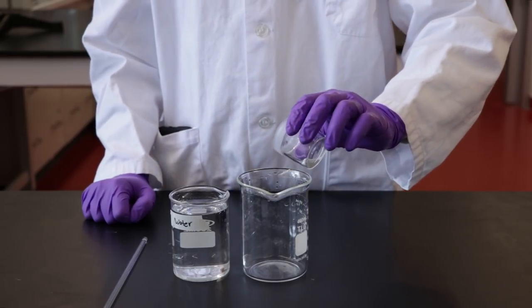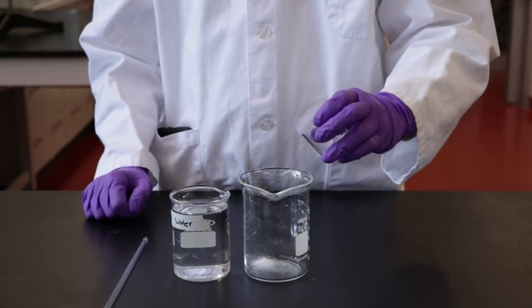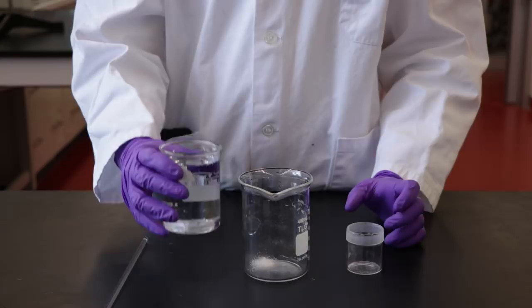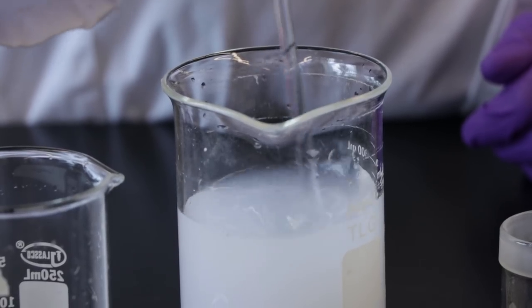Add the one gram of unknown mixture to a 400 milliliter beaker. Then add 200 milliliters of water. Stir the solution for one minute.